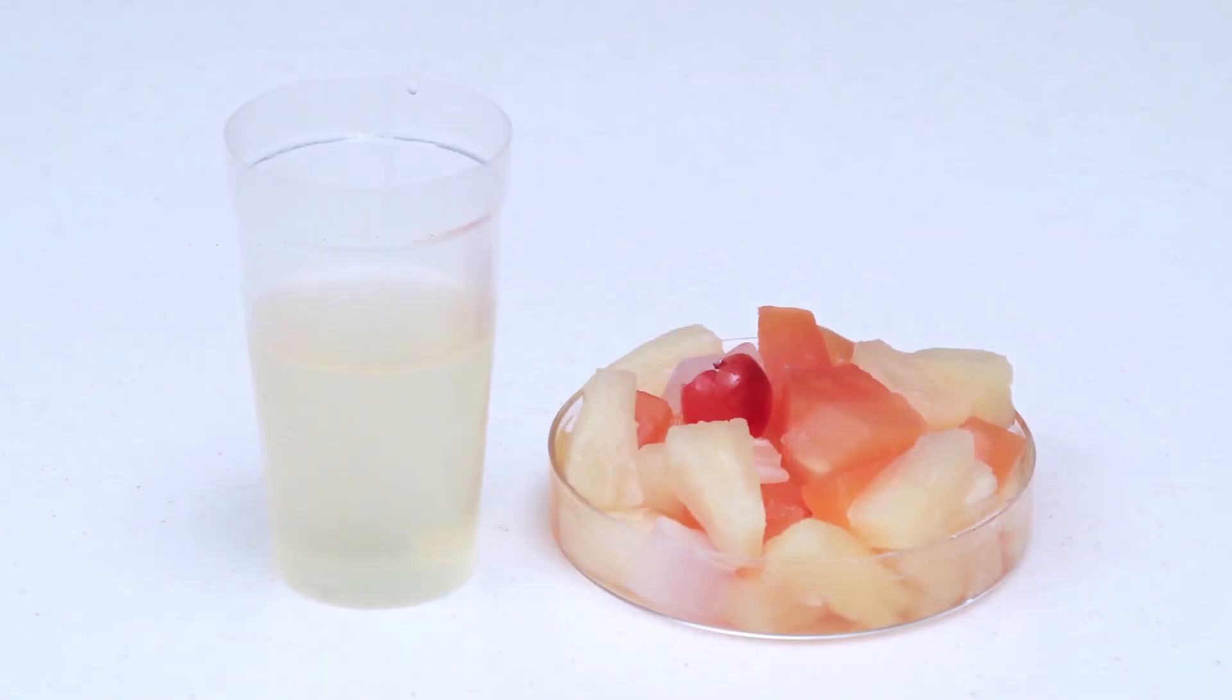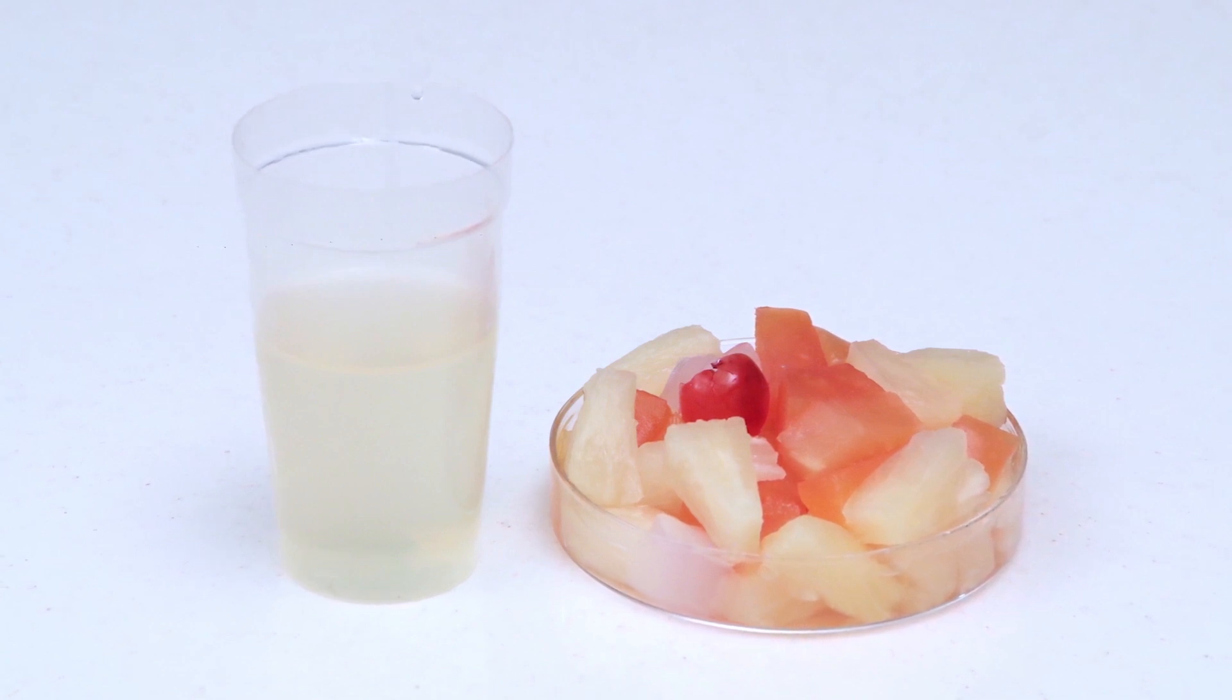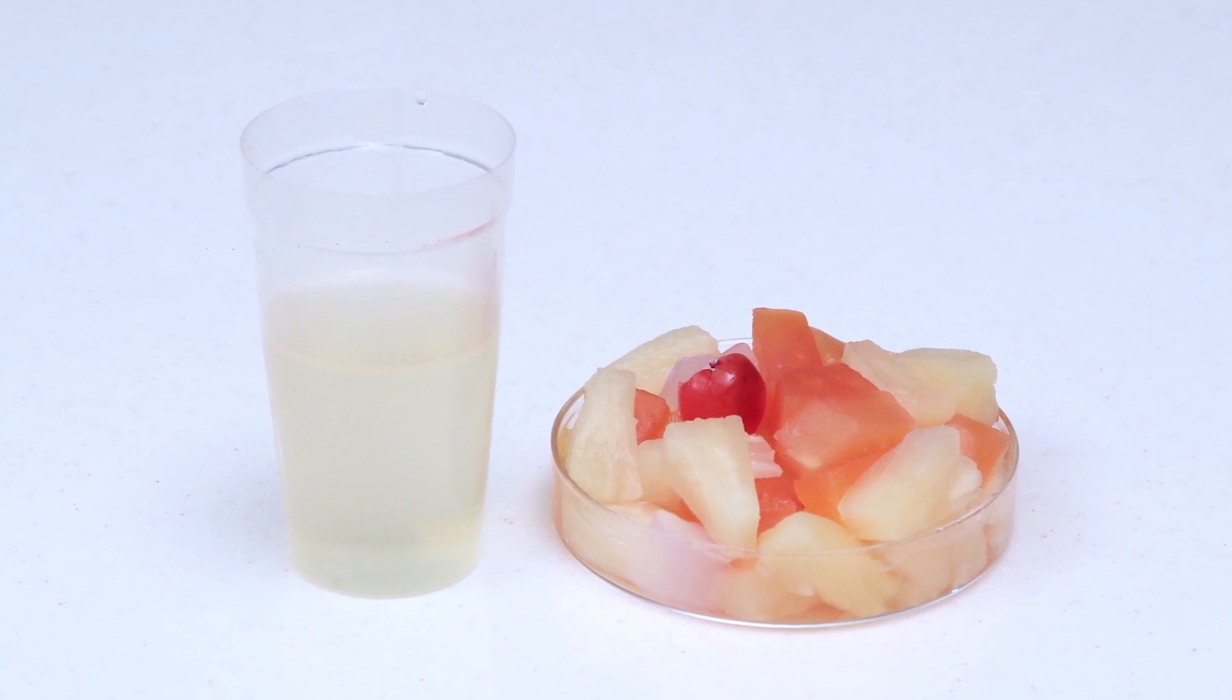A typical canned food consists of a mixture of liquid brine and solid food. The section 114.90 of 21 CFR recommends to measure the pH of solid and liquid brine separately.